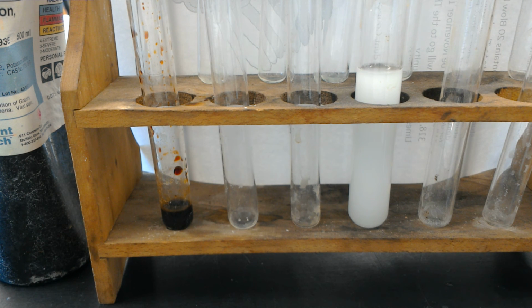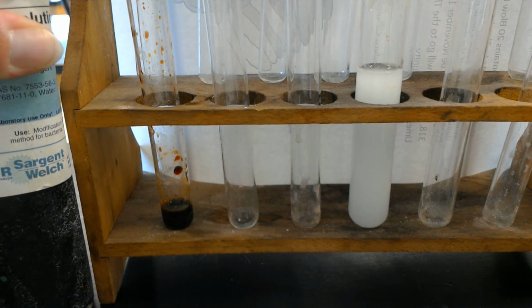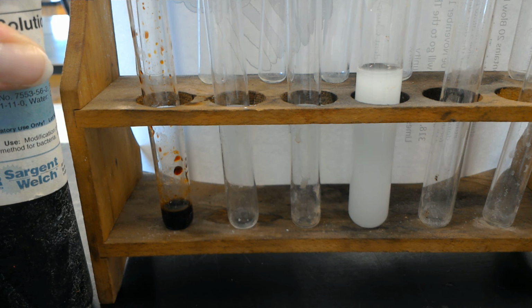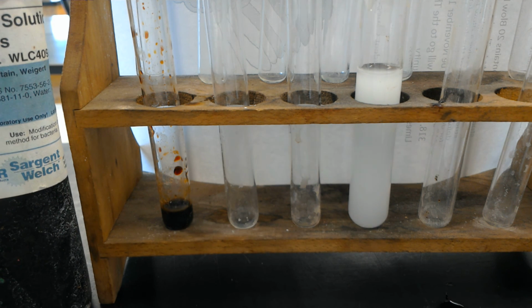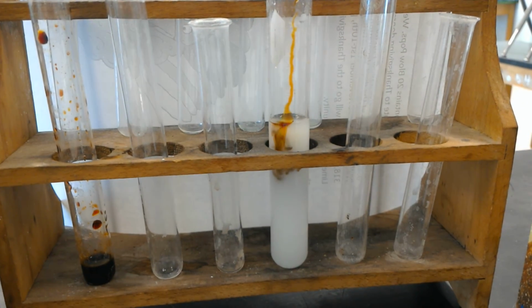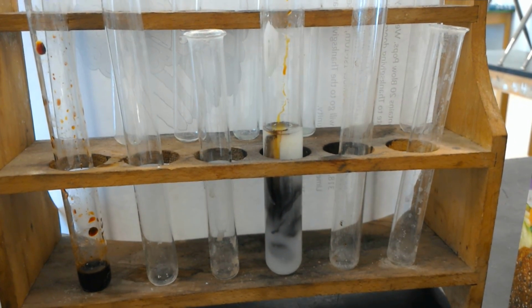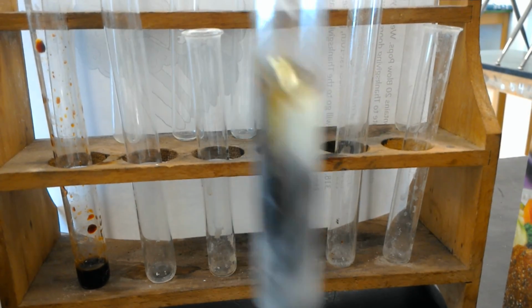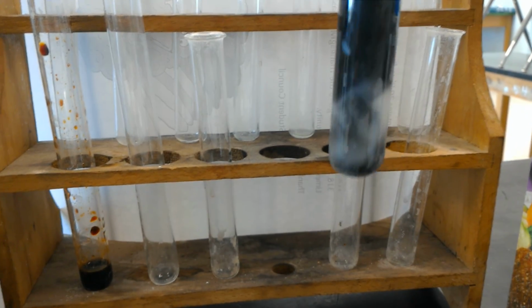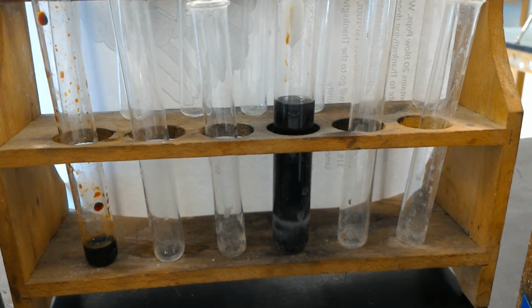Iodine is a type of chemical known as an indicator, which means that it changes color in the presence of whatever it is that it's supposed to indicate. And iodine will turn color when it is in the presence of starch. So, watching the starch test tube, you can see that it is no longer that browny caramelly color. Instead, it turns a really dark, like black purple color. And that's saying that, hey, there is starch present here, which, duh, we mixed up the starch in the test tube.